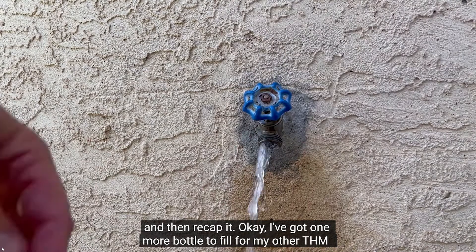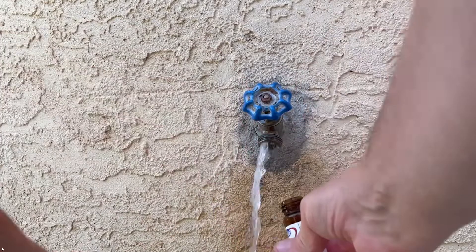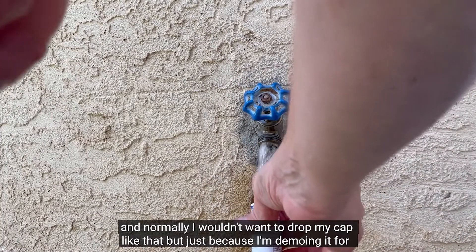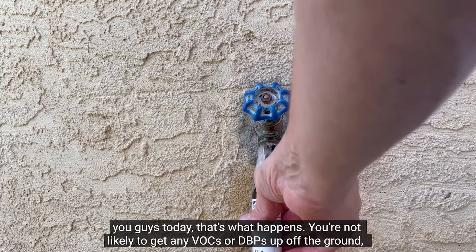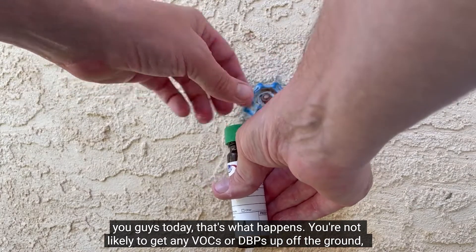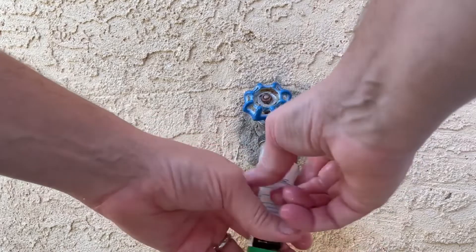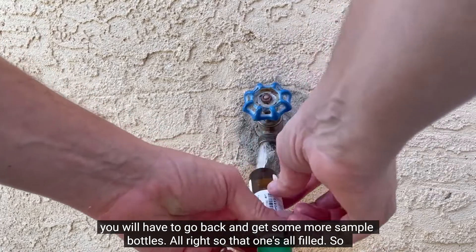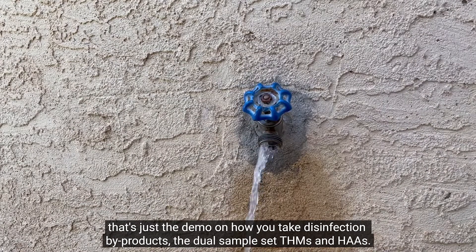I've got one more bottle to fill for my other THM. Normally I wouldn't want to drop my cap like that, but that's what happens when you're demoing. You're not likely to get any VOCs or contaminants up off the ground, but if you're concerned about dropping the cap, you will have to go back and get some more sample bottles. So that's the demo on how you take disinfection byproducts — the dual sample set of THMs and HAA5.